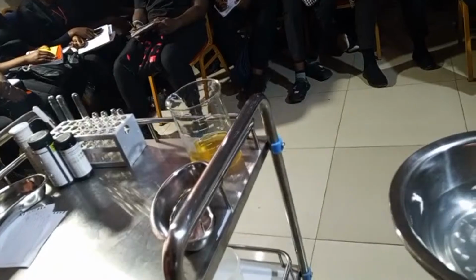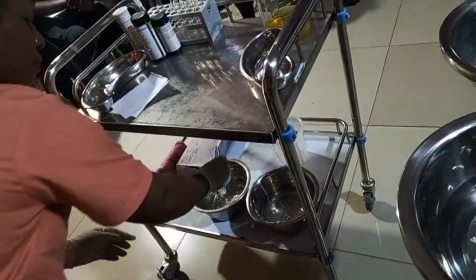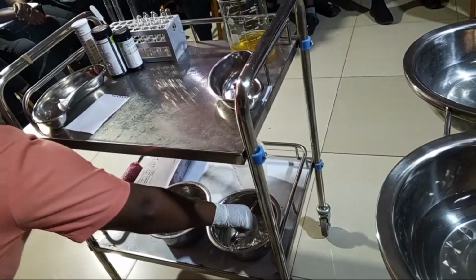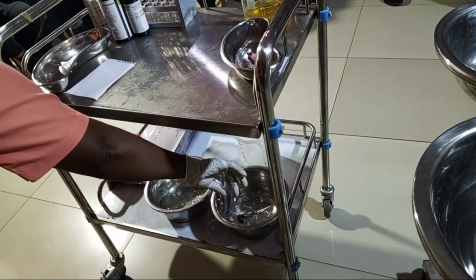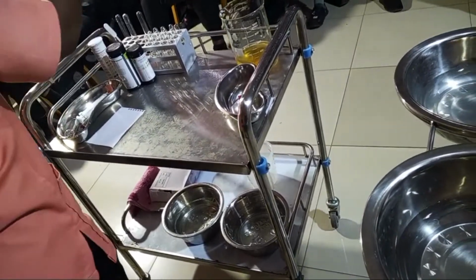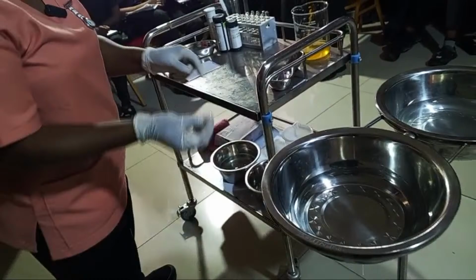So now I want to rearrange my table, right? So I have to wash. Remember, this is soapy water. This is soapy water, right? Rinse the test tube. And I place this here. This one I turn upside down because I've placed... Then I discard my syringe.